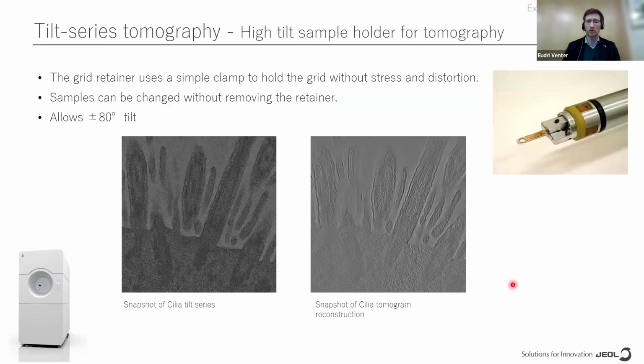And also, tilt series tomography is perfectly capable of being done with the system, with the JEOL high tilt retainer. You can tilt up to plus or minus 80 degrees. And here was just a screenshot of cilia cells that can be imaged.